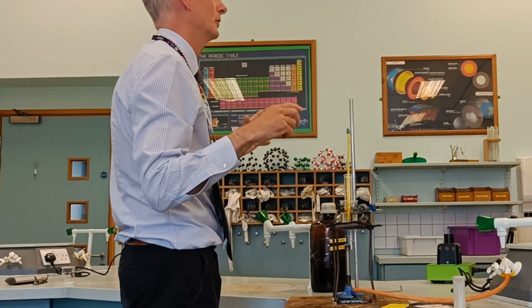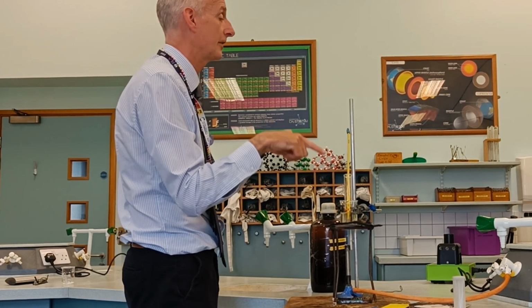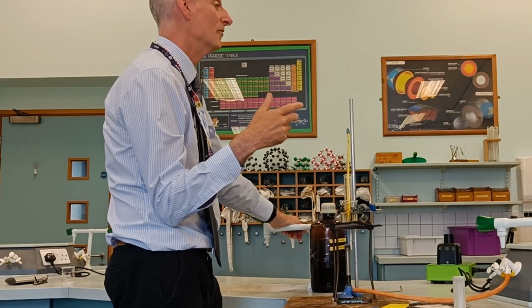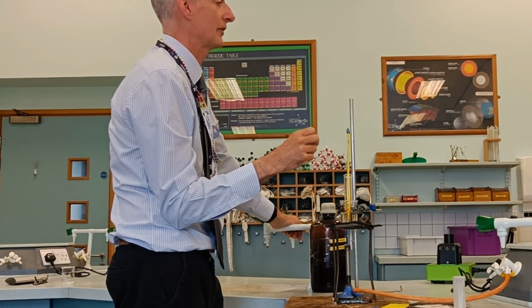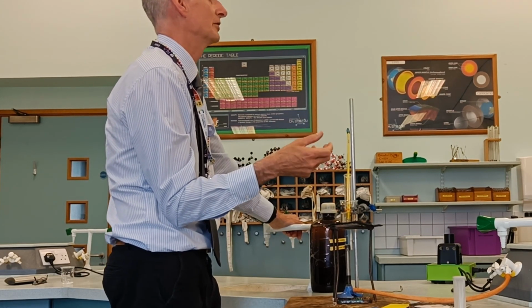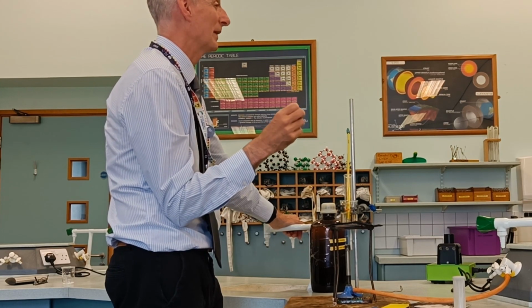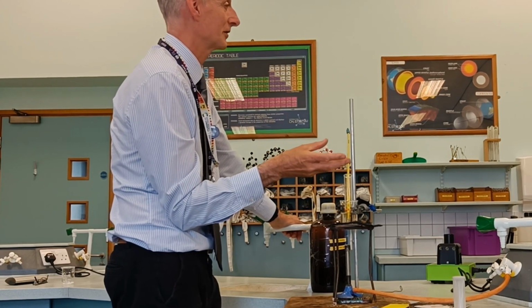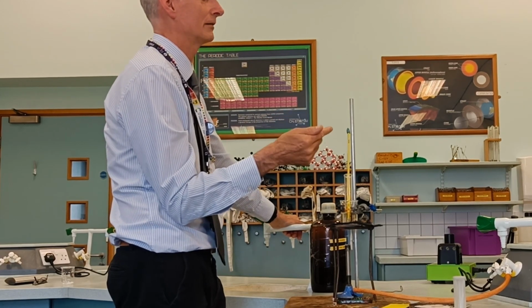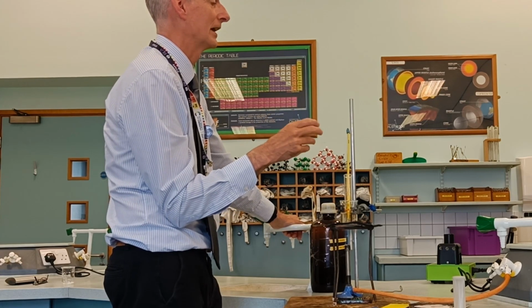So what we're looking for is when something melts. This applies whether you're using this version or the electric versions which you've got. You're looking for a clear sign when something melts. If you think about an ice cube melting, how do you know it's melting? It melts slowly over this big chunk, but basically you can't see through an ice cube, it's opaque. As soon as it changes to a liquid state, it becomes transparent. So you're looking for the change of whether I can see through it or not.